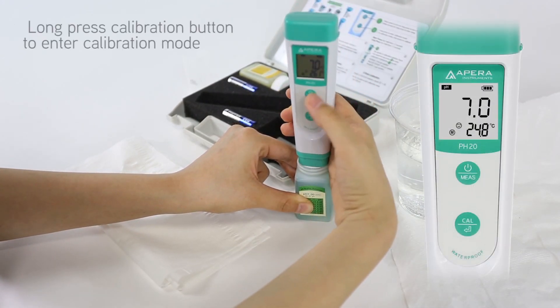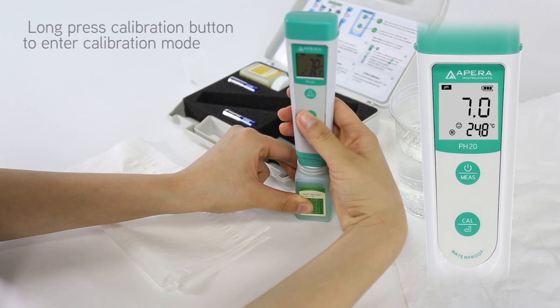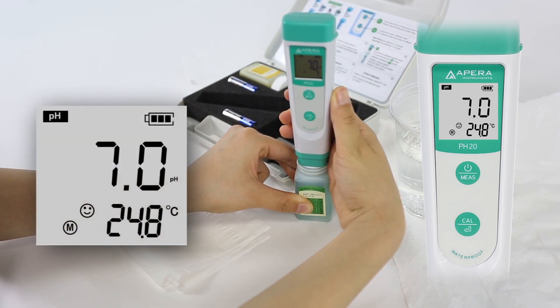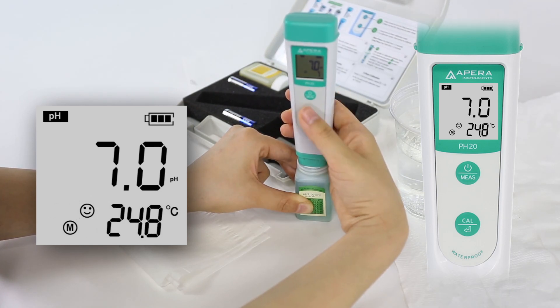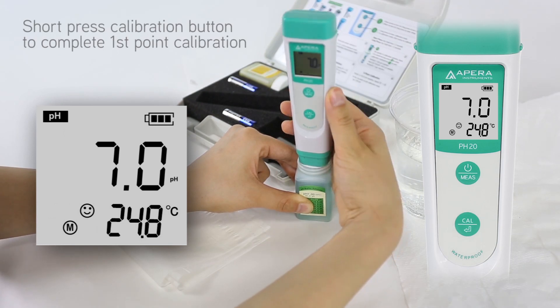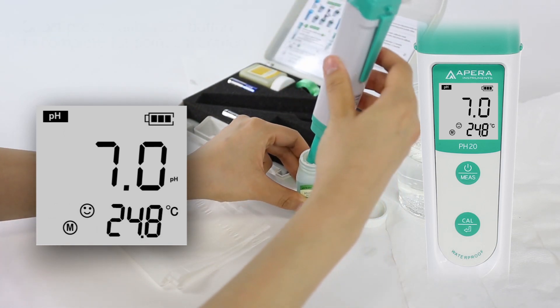Long press the calibration button to enter calibration mode. Gently stir and then allow it to stand still in the solution until the smiley face comes up. Then short press the calibration button to complete first point calibration. The tester will then return to measurement mode.